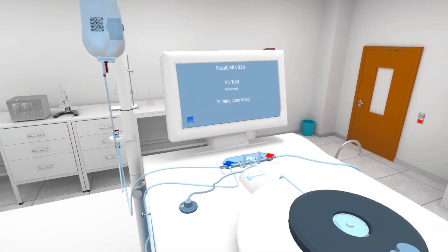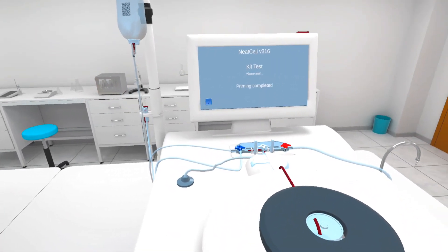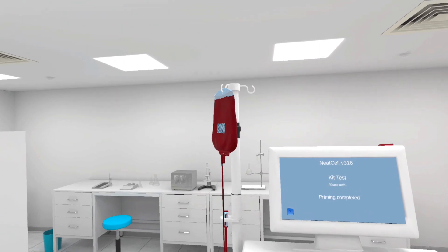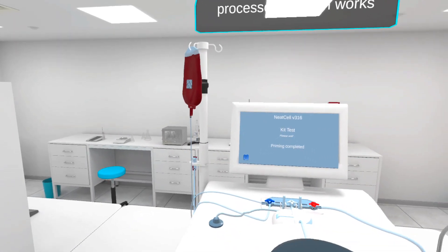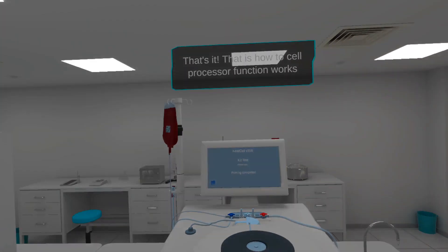The Buffy coat extraction sample flows into the final bag. After the RBC extraction, the process sample flows back into the drip bag. Now, let's see how the cell processor function works. That's it.